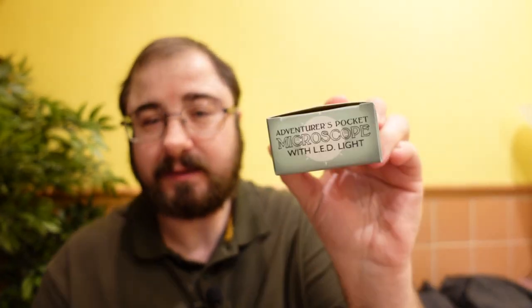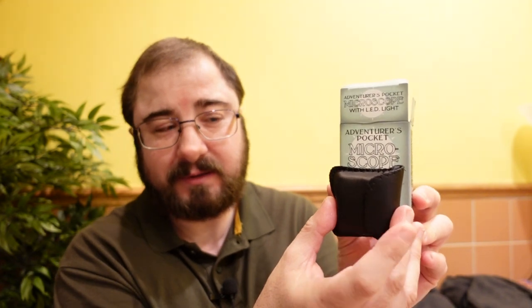I just thought it's really well thought out packaging. I paid five pounds and 99 pence for this. Let's have a look at what's inside. Tiny little case — you could have made that packaging half the size, it is a bit much. But then the packaging wouldn't have quite so much of an impact, because you've got this nice design going on. But at least we can recycle the box.